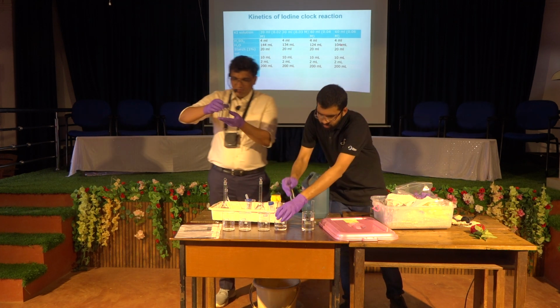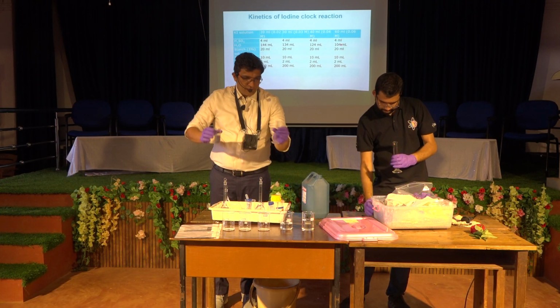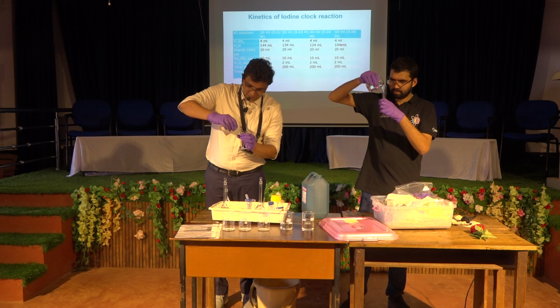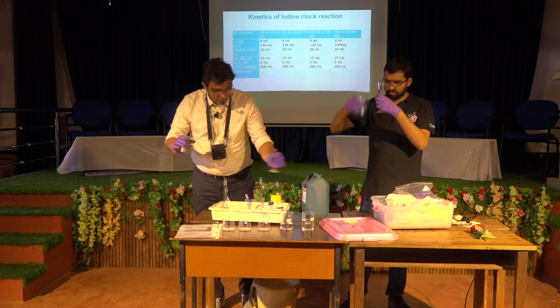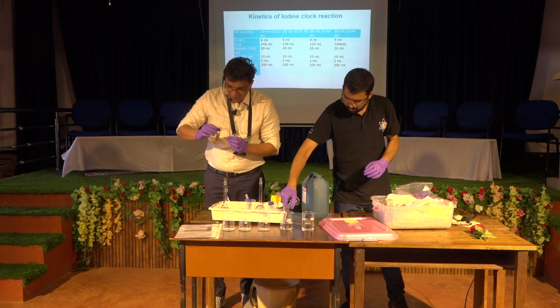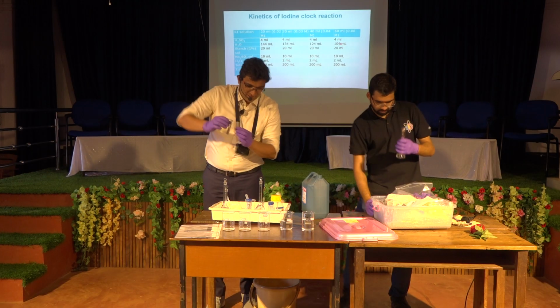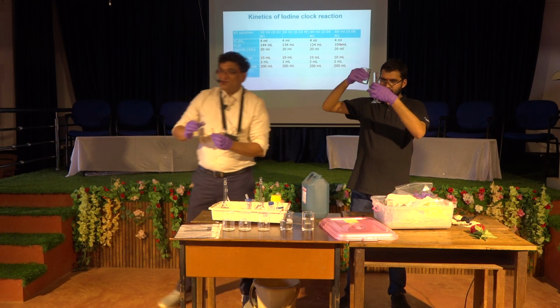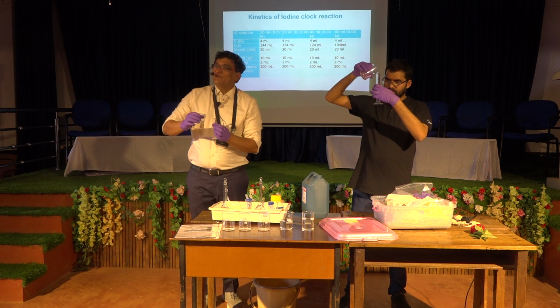Now I have a solution of starch here. Where do you find starch in natural sources? Potato. Is there any other source?